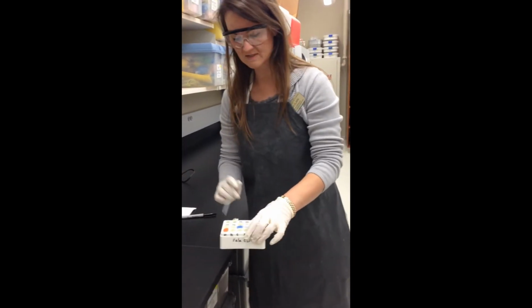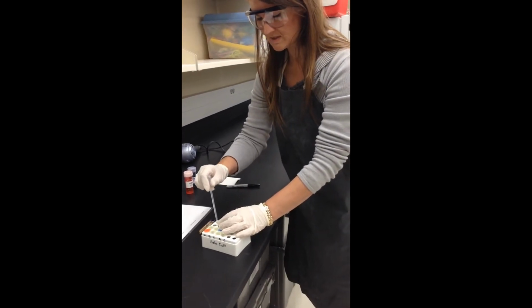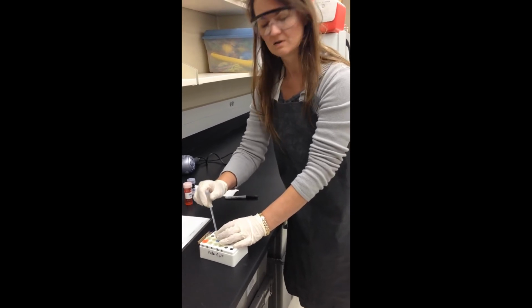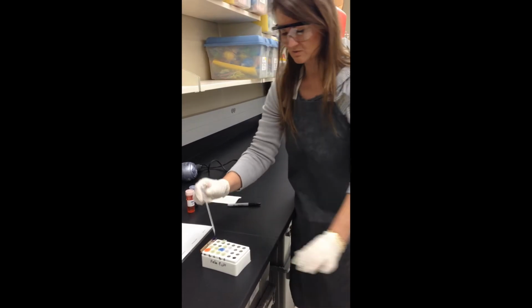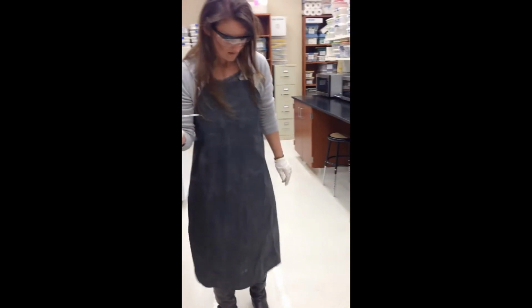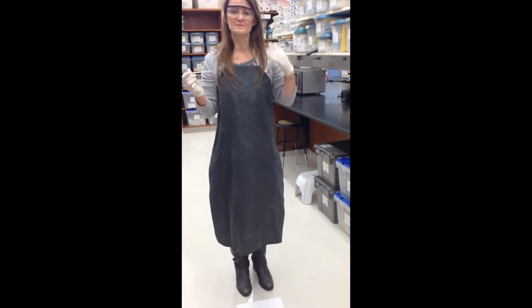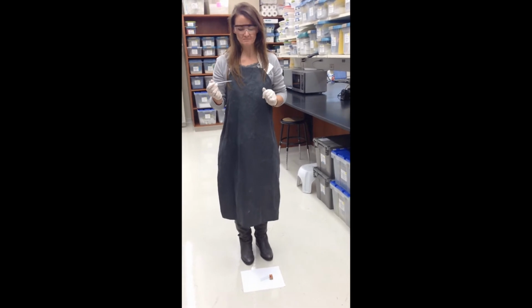This is your vial of cells. Your directions tell you to resuspend your cells by giving them a little bit of air. Then you will take some of those cells up into your pipette, and you're going to try to drop about 6 to 10 drops on your slide. Your directions tell you to drop it from 8 to 12 inches.